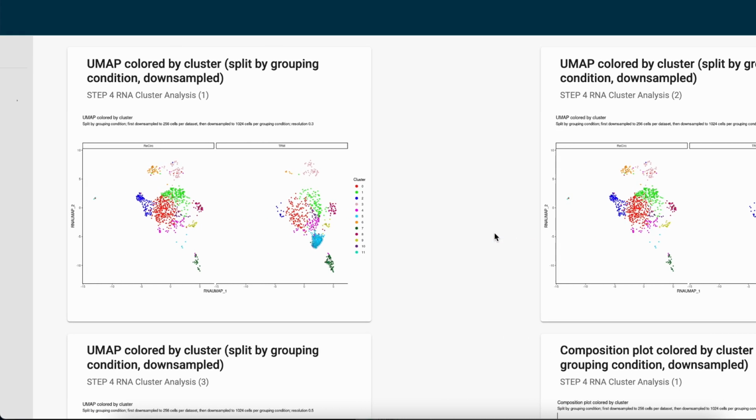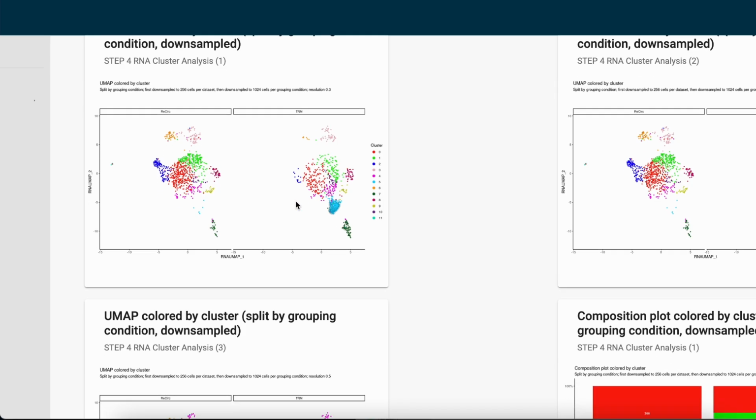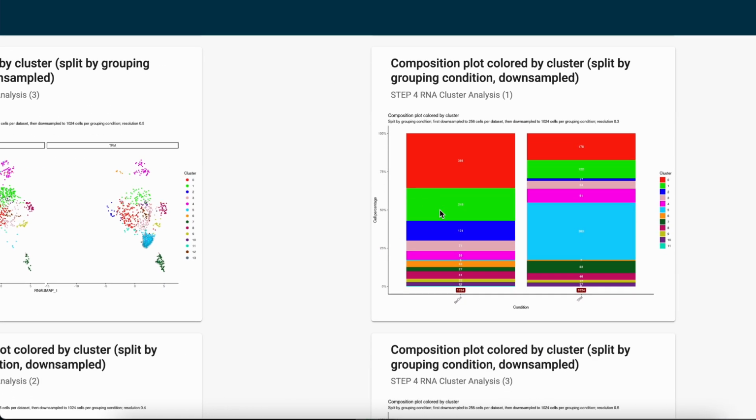We already see that our TRM samples have a cluster that isn't well presented in recirculating cells, as well as the cluster 2 here is not well defined comparing to the other group. With these numbers, you could calculate absolute and relative percentages if needed.